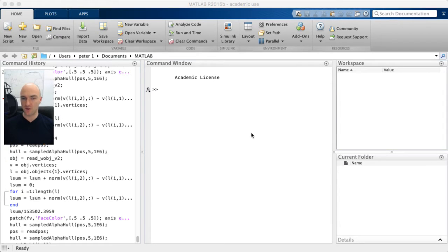I'll show you how to load in atom probe data, how to deal with it, what components the atom probe data has, and what you can do with it. This is supposed to be suited for everyone, even with no experience in Matlab, so we'll also go through the Matlab basics as we go, and I'll try to keep it to 15 to 20 minute chunks at the most, so that you can take certain aspects when you need them.